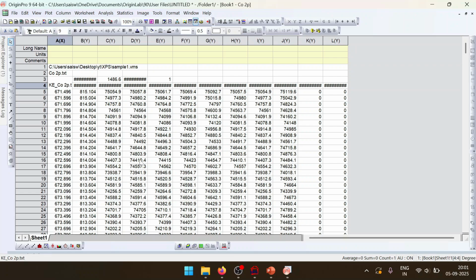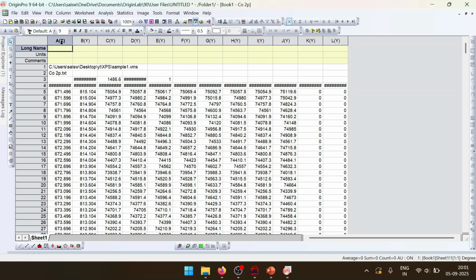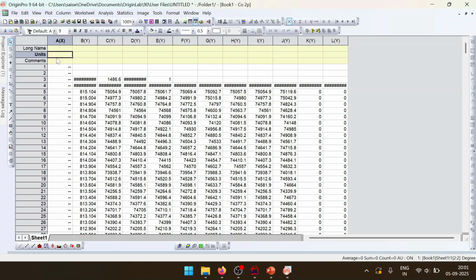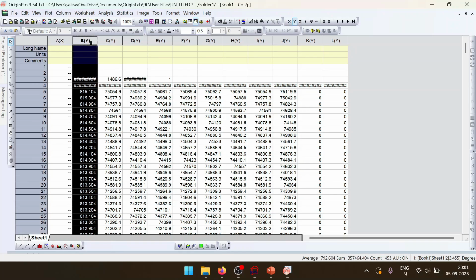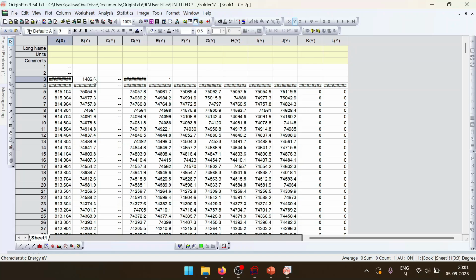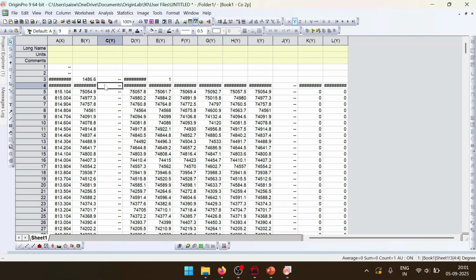So these are the components, and this is the envelope, background, all these things. With these plots that come out, the x-axis comes as kinetic energy. You should always plot as binding energy, because kinetic energy is used in Auger electron, not XPS. So just select this and press the delete button. Don't right click and delete because the whole column will go. You just need to press the delete button. Then cut these two columns and paste them here. Then the last column here.